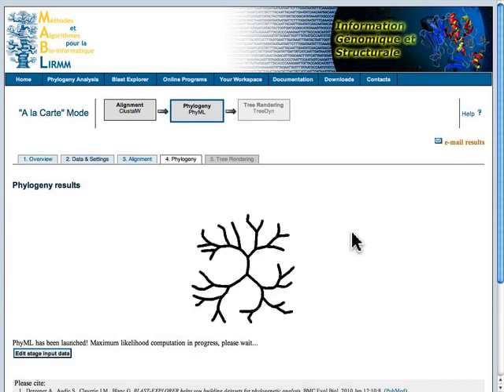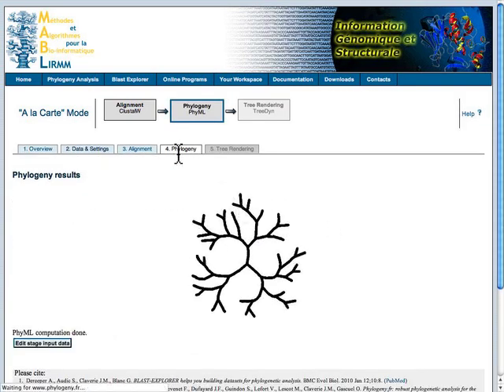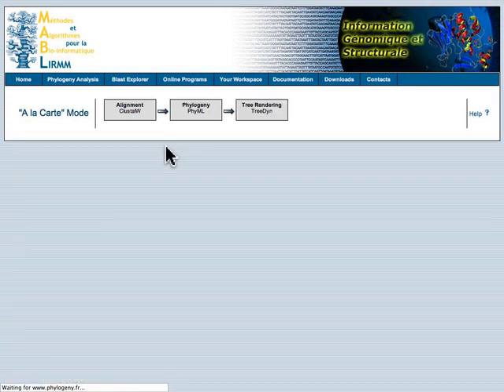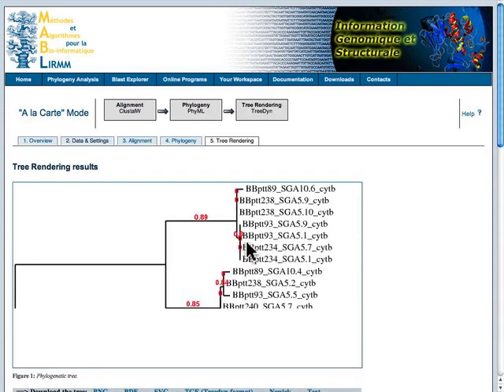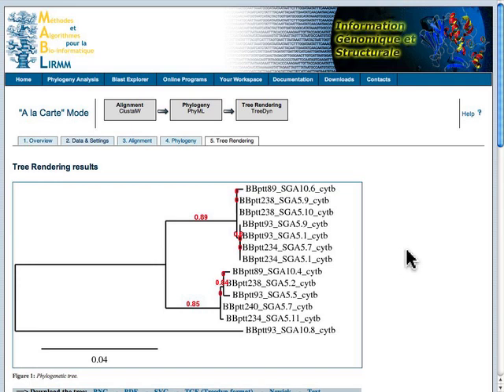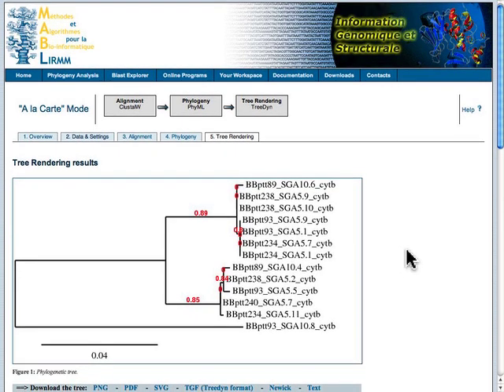That step has been completed. You can see we've now moved to the phylogeny step, and we had the growing tree. And now it has a representation of our output in our tree rendering program.